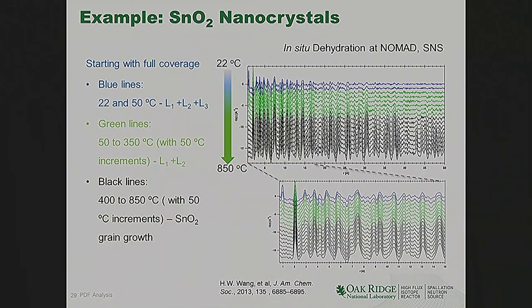And when you measure this material in our dedicated total scattering beamline NOMAD, which is the highest flux neutron total scattering instrument in the world, you see something really interesting. So these materials were made in a deuterium environment, and so they have heavy water at the surface so that we can study them well with neutrons.